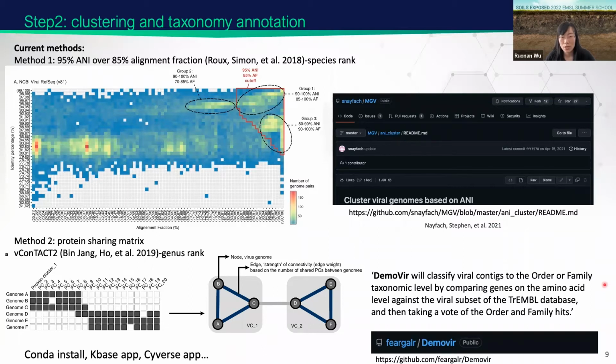And also the documentation of these computing steps and the detailed scripts can be found at this link, or you could simply search the repo name as shown here on the GitHub website. So this script has been published for literature studying DNA viruses from the human gut microbiome, but the methodology used here is the same if you want to study soil viruses or marine viruses.